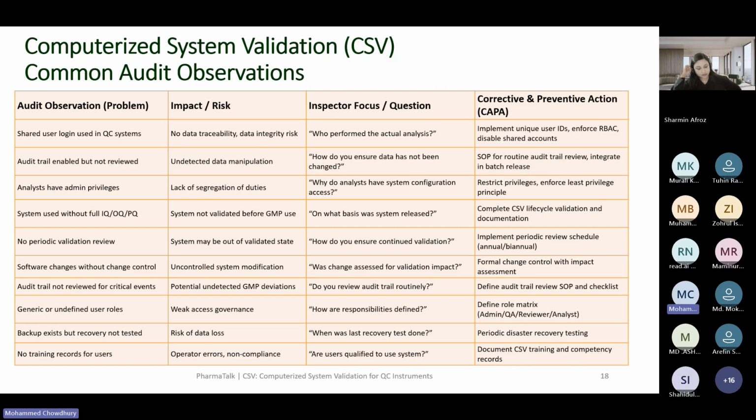And then you already presented the key deliverables. First, you presented the category as per the USP, software categories, right? C for the computer system, complex, critical.